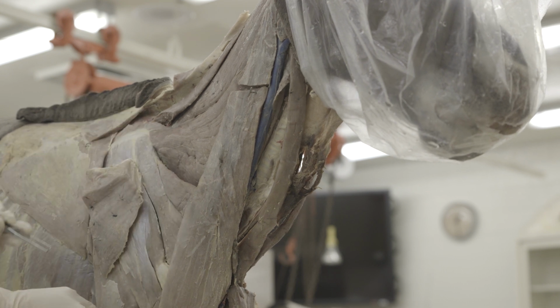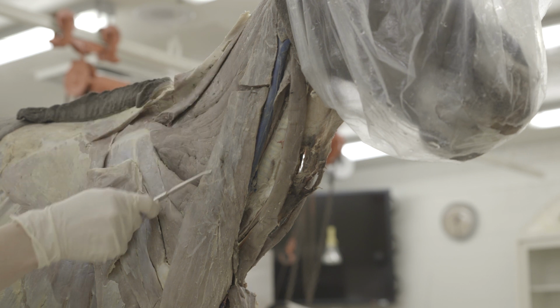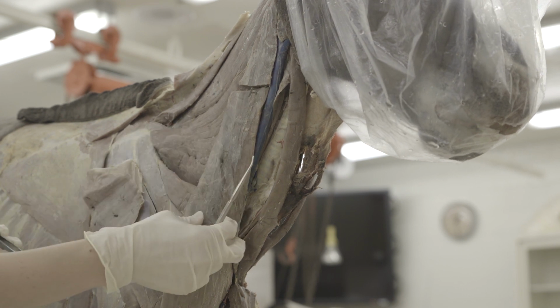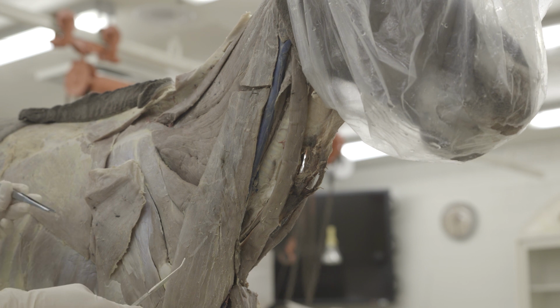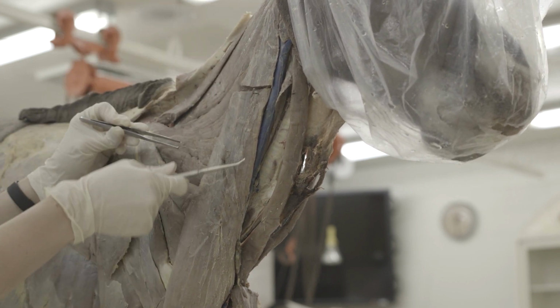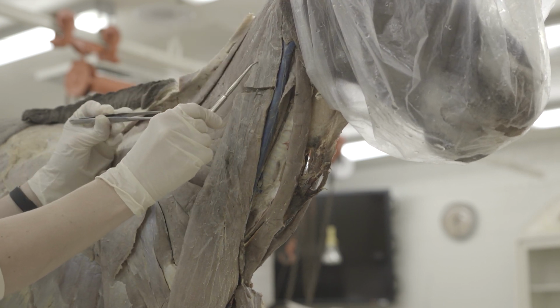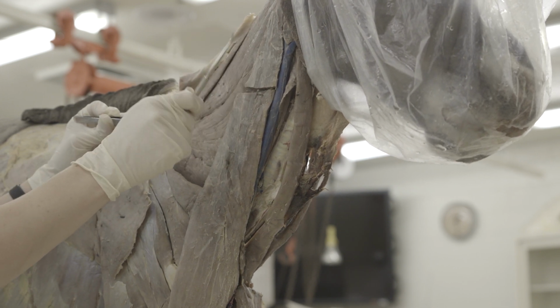Then here we actually have our brachiocephalicus muscle that's intact. So on this side, you're actually going to be transecting through your brachiocephalicus muscle to reflect this distal portion so that you can see the omohyoideus muscle underneath. But here we have brachiocephalicus, and here in the pony we have just that cleidocephalicus part here that has cleidomastoideus. That's the only part that the pony has, is the cleidomastoideus.